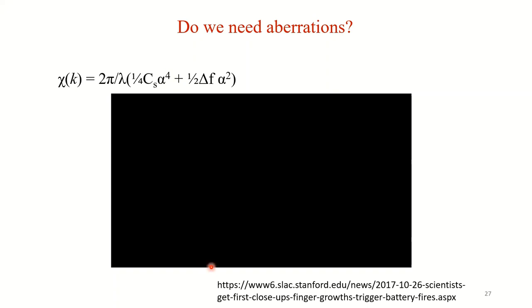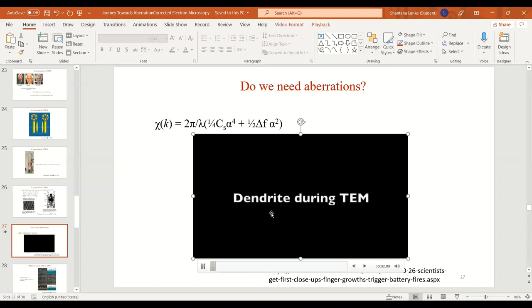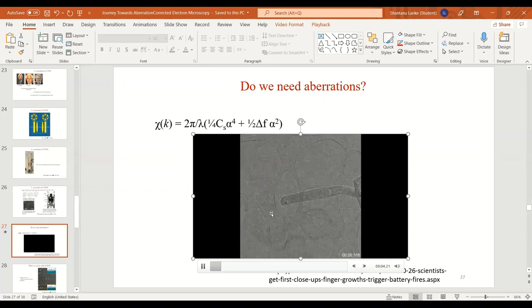Here I'd like to show you a small video. I just picked it from this website here, and here you can see a lithium dendrite. I'm magnifying, and it's melting in conventional TEM.